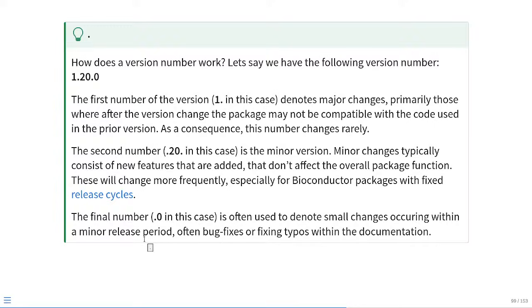Gabriella has a question. Do we need to install packages every time? No, you only need to install the package once. But once you've installed the package, you just need to make sure you attach the packages to your local environment. Oftentimes what I'll do, and you'll see this in some of the worked-through examples, is there'll be a code block that has the install.packages commands to install everything. Once I'm done with that installation, I'll deactivate that code block or just get rid of it entirely, keeping just the library code block to load in individual packages. So yes, you just need to install them once. You don't need to install them every time you load in. That would take a significant amount of time.